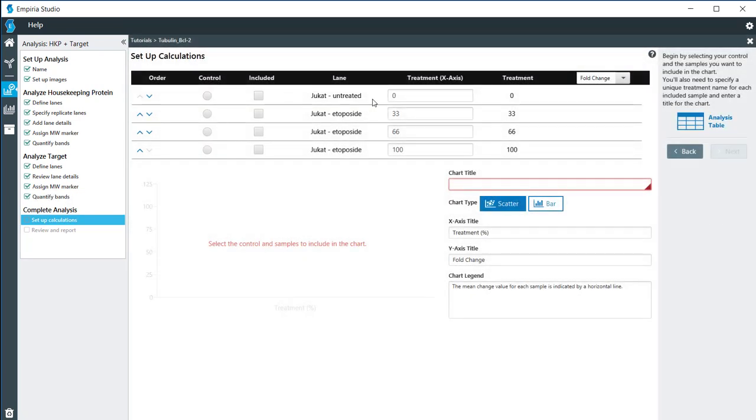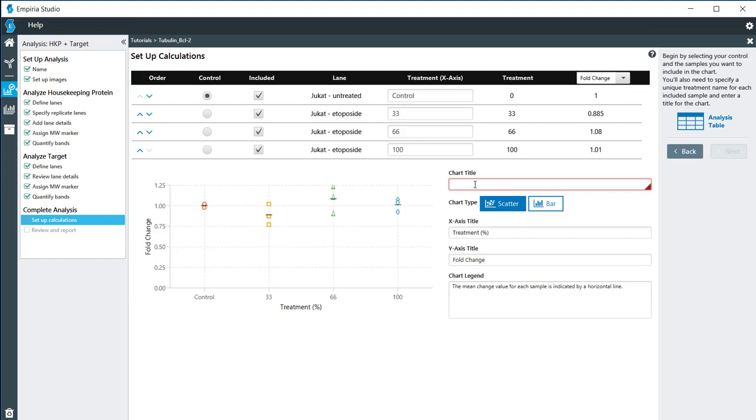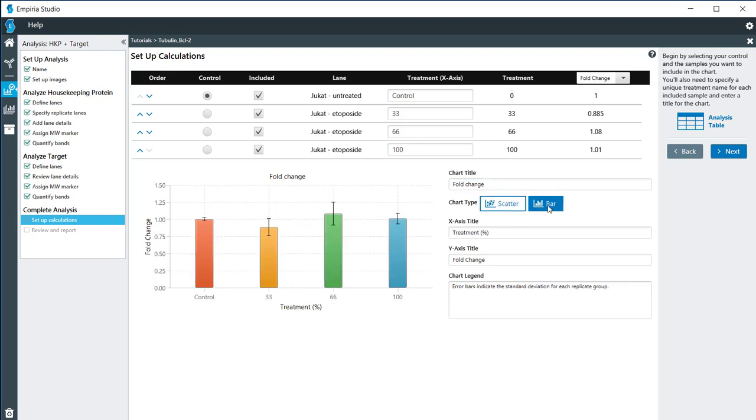My untreated, I'm going to set as my control, but I will also include all my other replicates on here. I'm going to call this fold change. You can look at the graph either as a scatter plot or as a bar chart. We have the controls right here, and then we can look at the various treatments. They also do have the standard deviation for each one of the treatments on there.